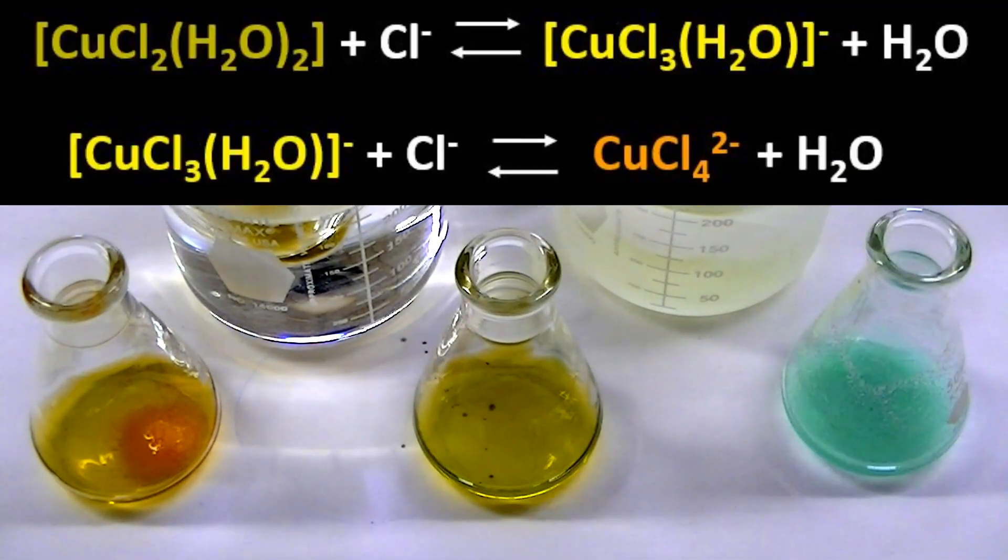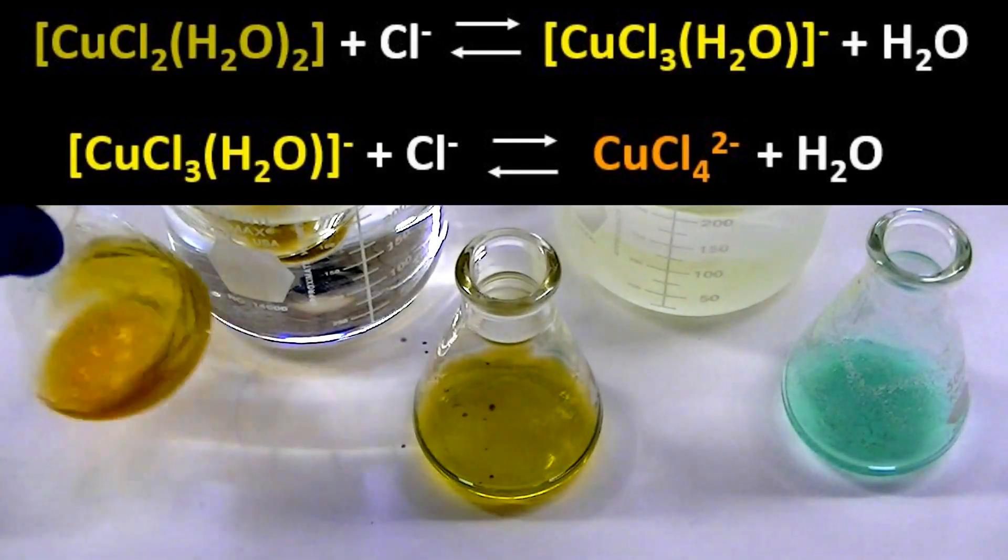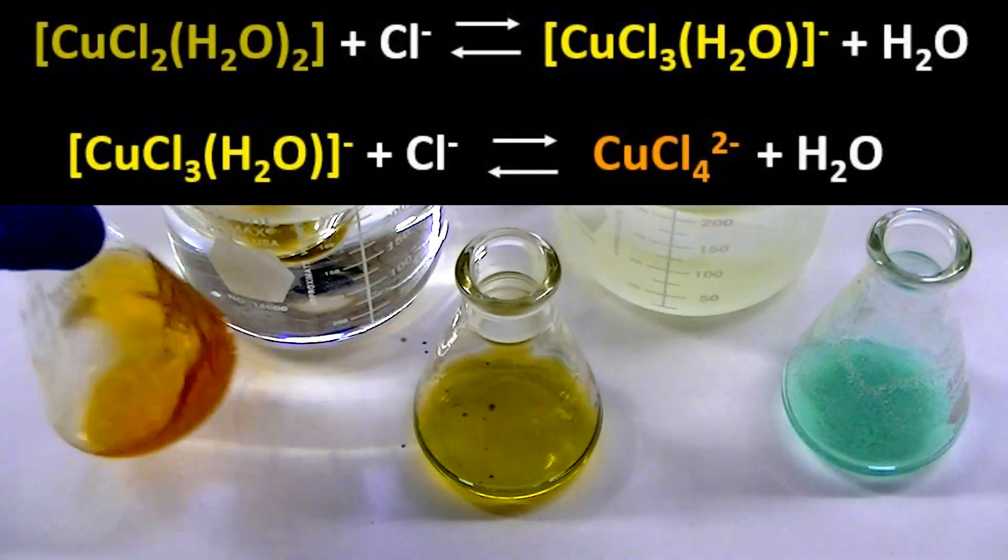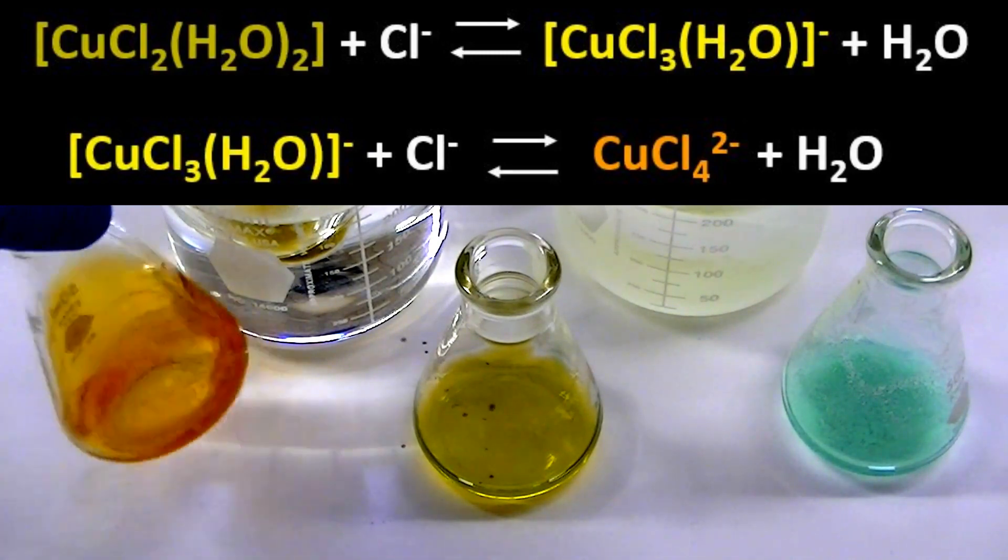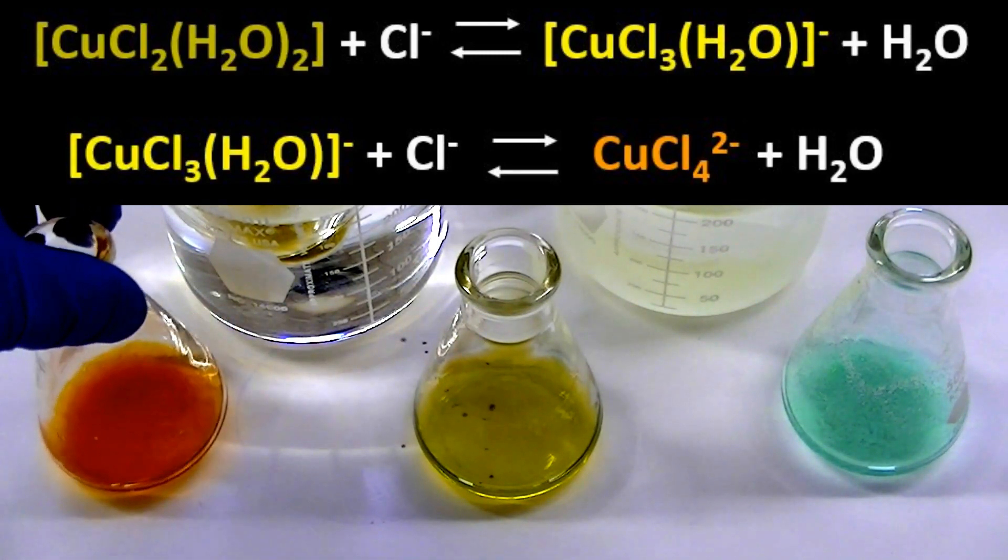The addition of salt to this flask increased chloride ion concentration. This shifts all equilibria displayed above to the right, favoring the formation of the orange tetrachloro-copper complex.